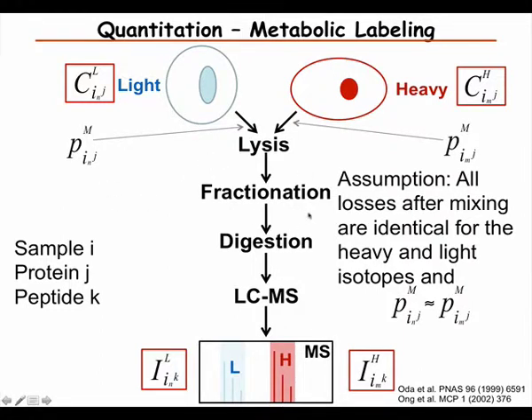If you do a reciprocal experiment, like instead of doing light with this, heavy with this, do you get approximately the same results? Yes, but most people do that experiment. So you do both, preferably. You have your wild type and your control and your experiment, and label one first and then the other and compare. And usually you would only consider the proteins that give a reproducible ratio in those two cases.